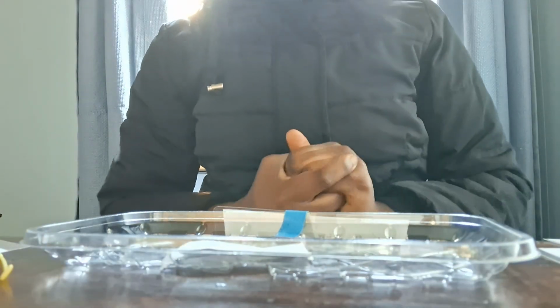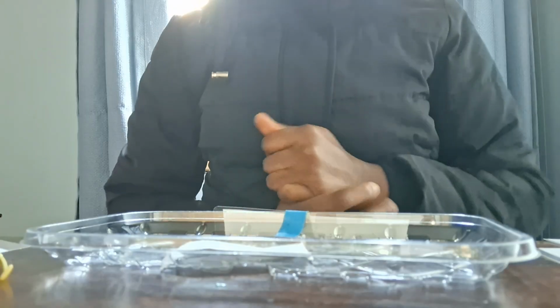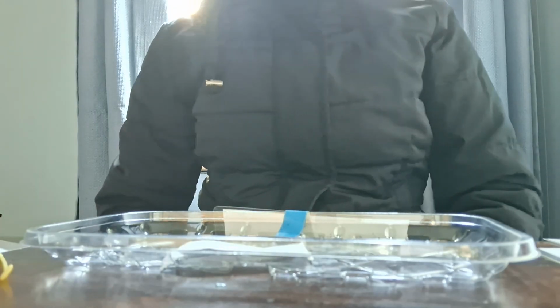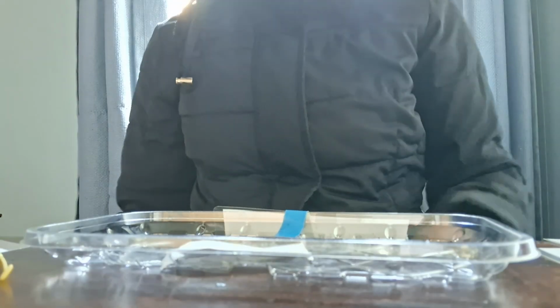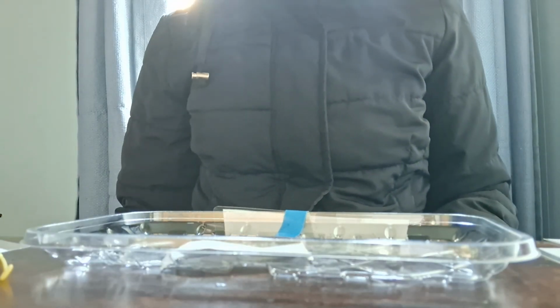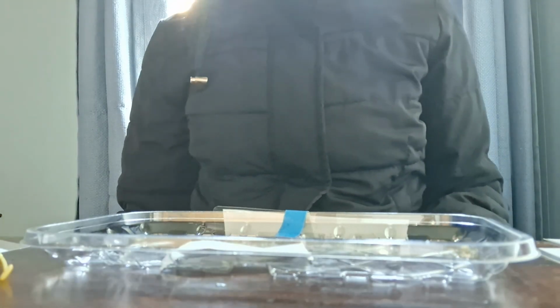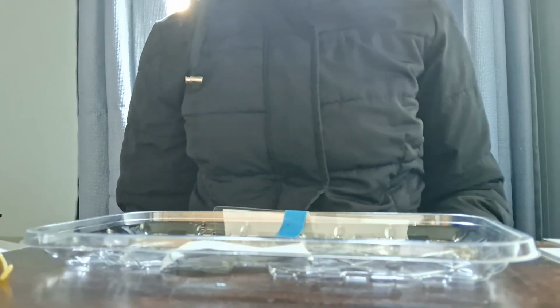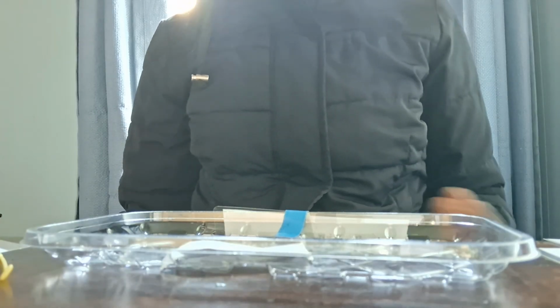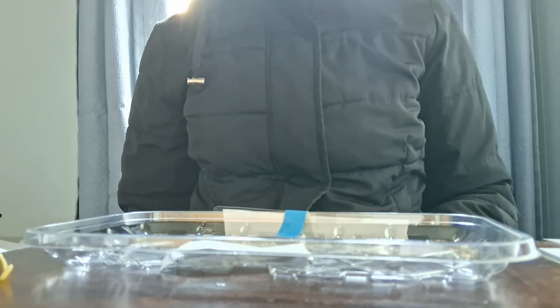We're going to continue. What I'm going to do right now is the acid-fast and differential staining, whereby it's used to show they retain the primary stain even after acid alcohol. They are used to show acid-fast bacterial organisms. So what I'm going to do is the acid-fast staining.